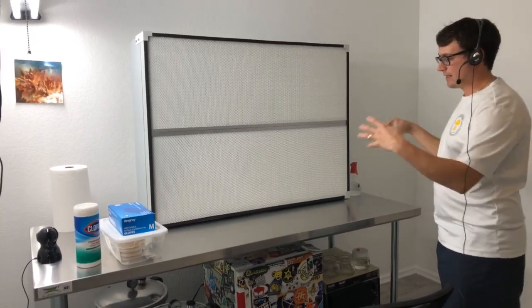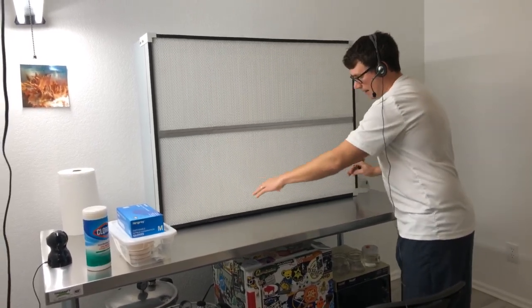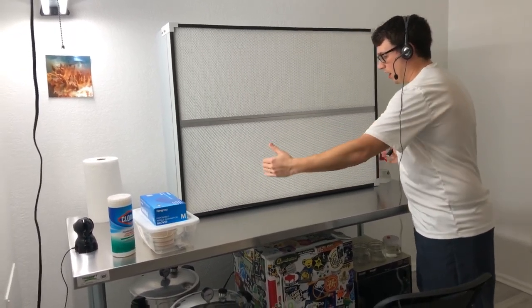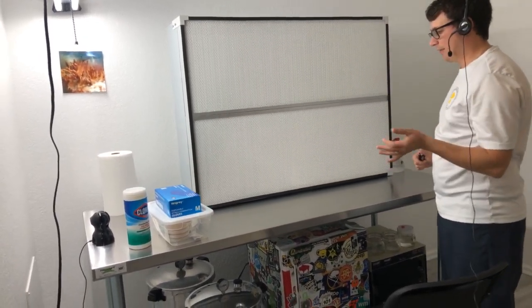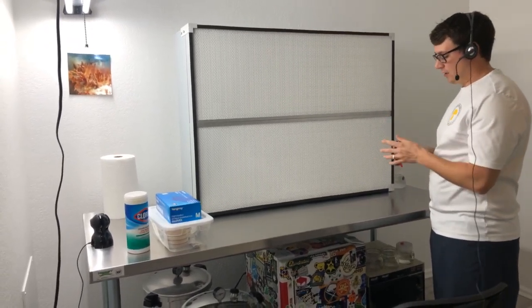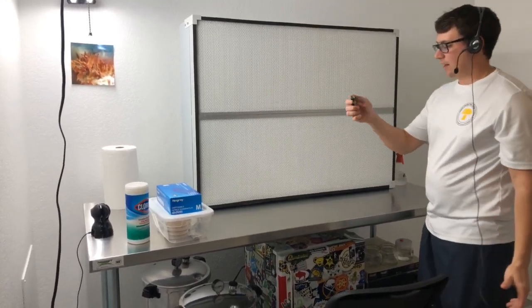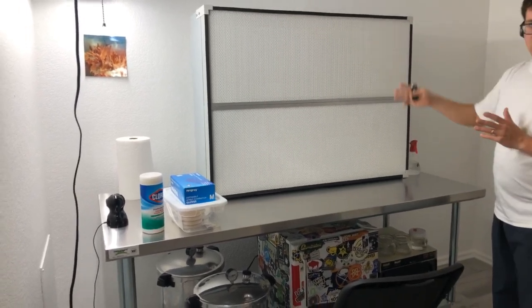I'm going to be testing the air quality using petri dishes and trying to lay out our workspace so I can figure out what is the cleanest area in this flow hood. If you don't have petri dishes, one thing I like to do to prove the flow hood is working properly is take a lighter and calibrate it or search for any dead zones.